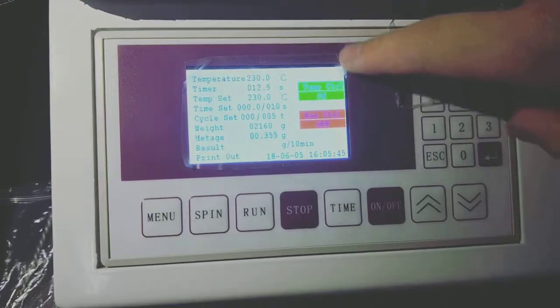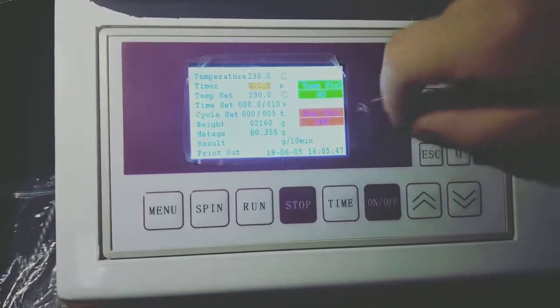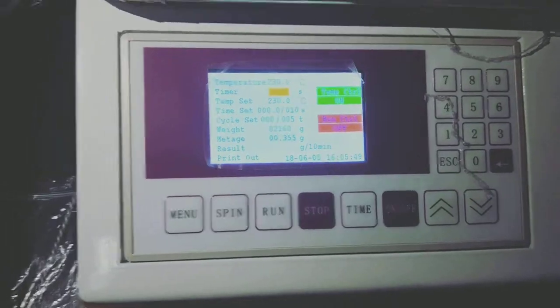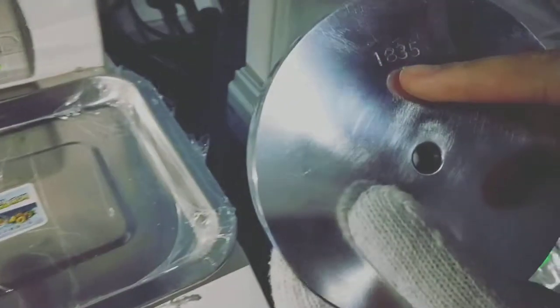Now the time is almost reaching zero. Then we choose this weight 1835, and this rod is 325. All this added together is 2160.